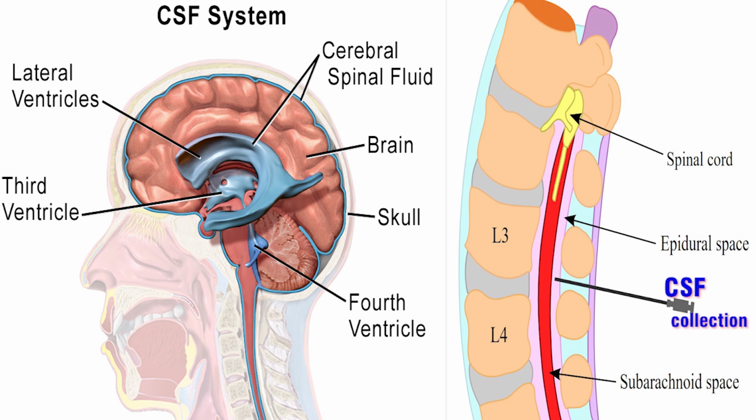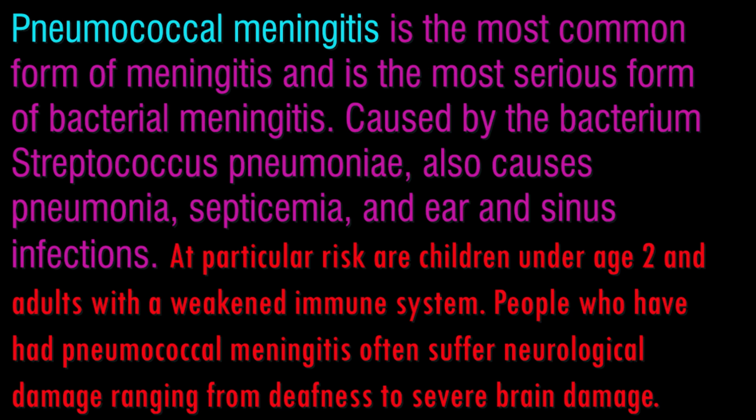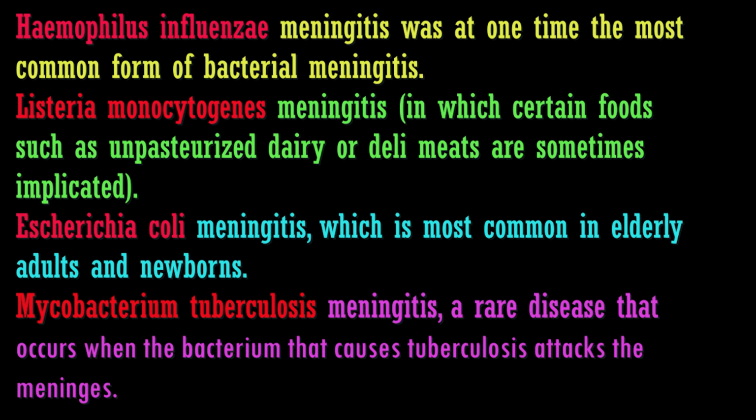CSF, cerebrospinal fluid: Gram stain after centrifugation at 1000 to 1500 rpm for 10 minutes, or the cytospin smears can be used for Gram stain. Blood agar and chocolate agar are commonly used. We can add thioglycolate medium for CSF collected from a shunt.